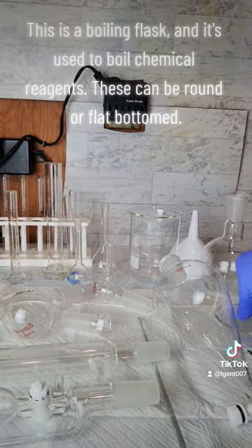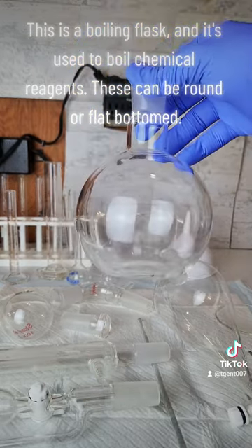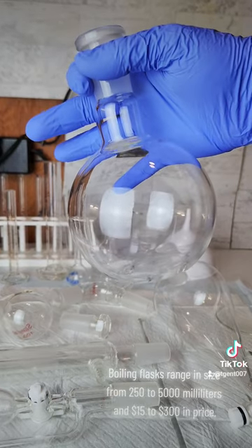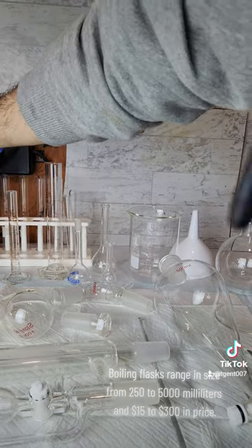This is a boiling flask and it's used to boil chemical reagents. These can be round or flat bottomed. Boiling flasks range in size from 250 to 5,000 milliliters and $15 to $300 in price.